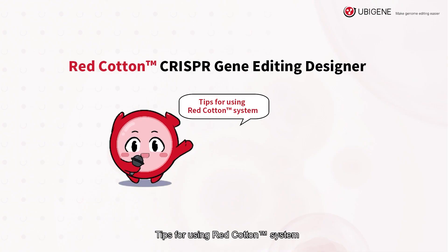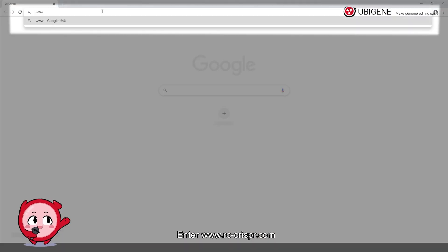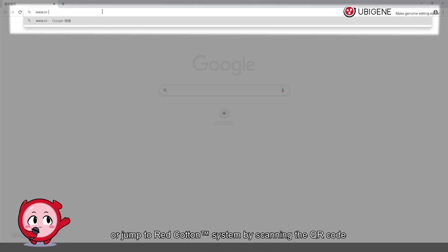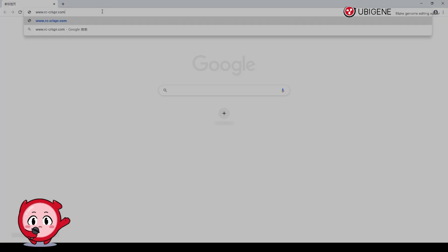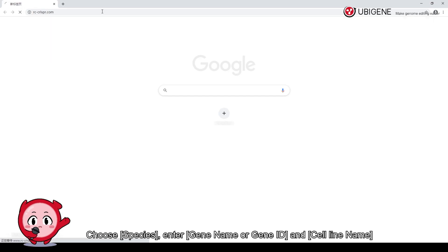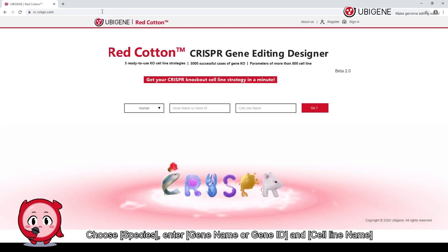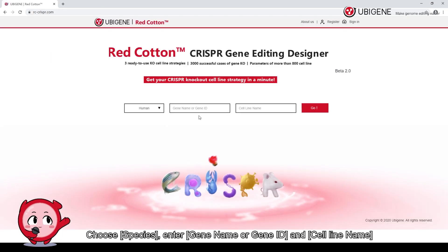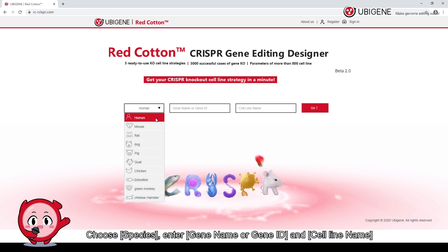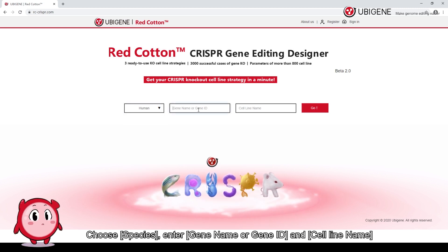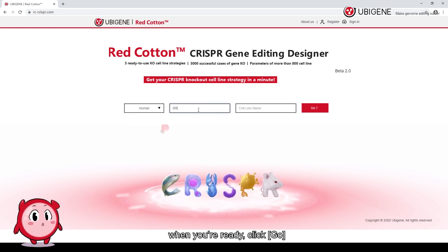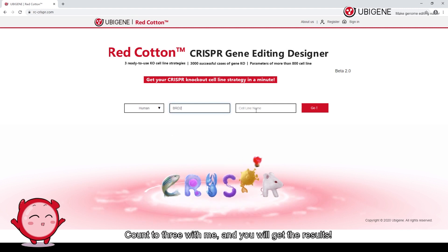Tips for using the Red Cotton System: enter the link or jump to the Red Cotton System by scanning the QR code. Choose your species, enter the gene name or gene ID, and the cell line name. When you're ready, click Go.